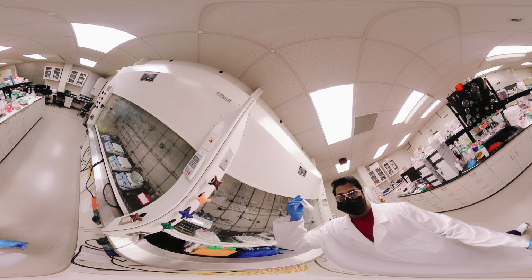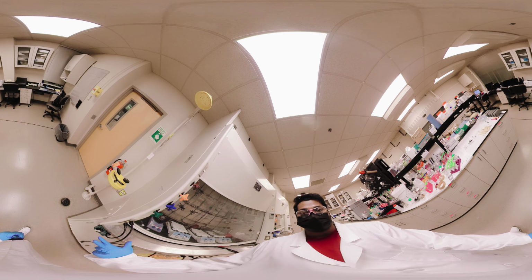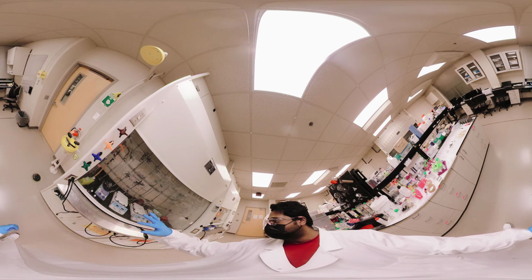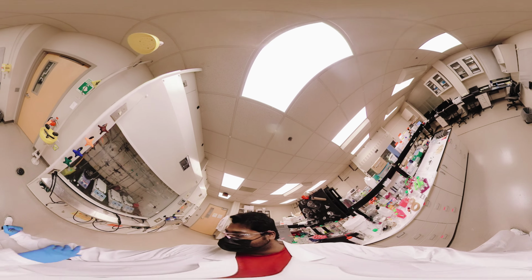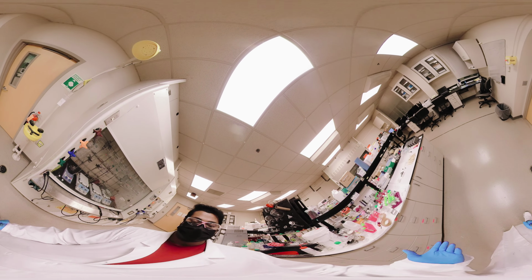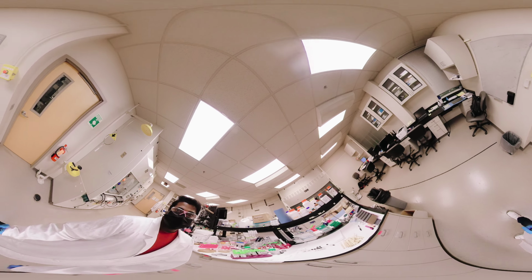Besides that, we are also preparing nanoparticle synthesis. Those nanoparticles are loaded with some drug or other targeted material for our applications. We have some nitrogen pumps over here, so you can adjust the nitrogen flow if you need nitrogen conditions for any reaction. These are the bench tops we are using for our synthesis as well.